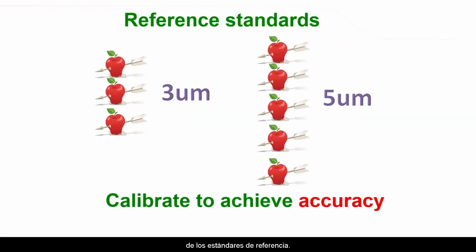I wanted to mention the importance of reference standards. In order to achieve traceable, accurate analysis, you require reference standards to calibrate the instrument. In keeping with our Bowman analogy, this is the equivalent of needing to calibrate the scope or reticle on your bow. You can use the same fruit illustration of charting quantity and size of the calibrations, or in our analogy, apples, in order to plot your regression curve to allow you to identify the number and size of the apples.